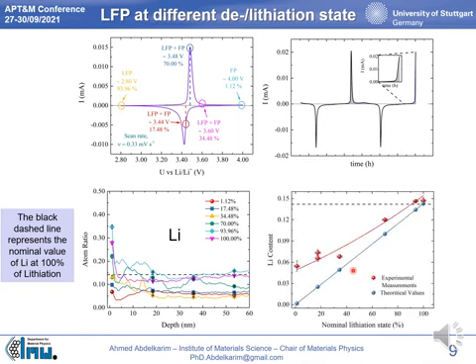The lithium amount as compared to the expected contents is shown. Lithiation of the fully delithiated phase ends by filling up all available sites, which is reflected by getting the complete lithium amount. By contrast, delithiation of the fully lithiated phase records a higher amount than what was expected.